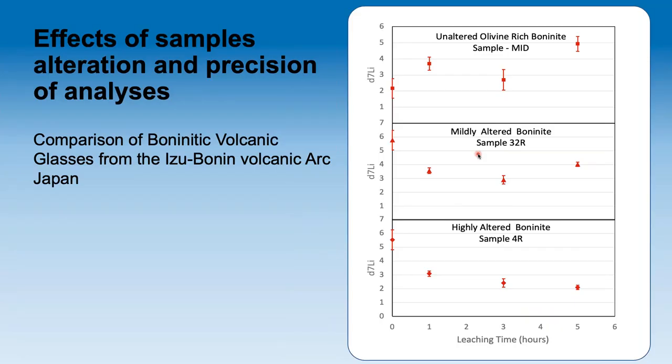So I'm almost done. I'm gonna give you a couple of real-time examples. This is the work that my colleague Alex and his advisor Jeff Ryan are doing on some samples that they drilled out of the seafloor south of Japan. This is on the Izu-Bonin Arc.